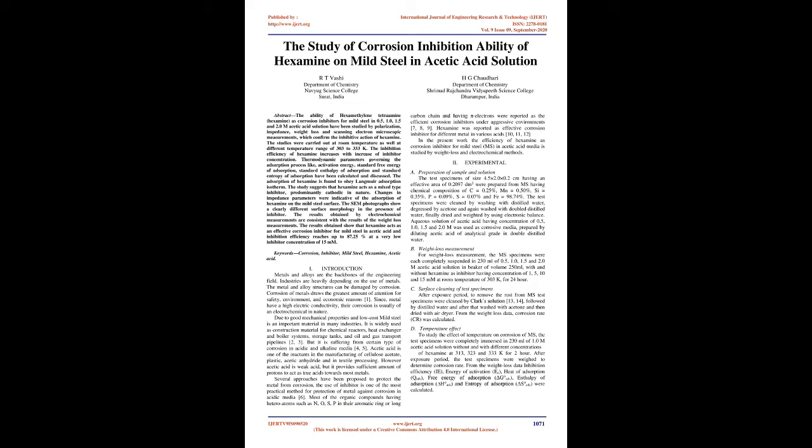Introduction. Metals and alloys are the backbones of the engineering field. Industries are heavily dependent on the use of metals. The metal and alloy structures can be damaged by corrosion. Corrosion of metals draws the greatest amount of attention for safety, environmental, and economic reasons. Since metals have a high electric conductivity, their corrosion is usually electrochemical in nature.